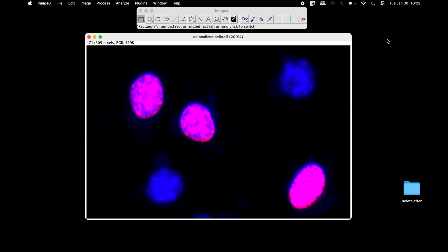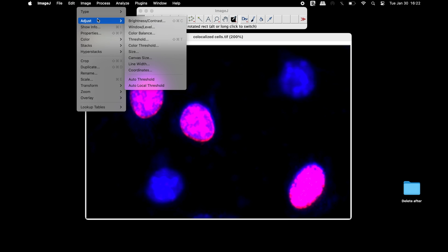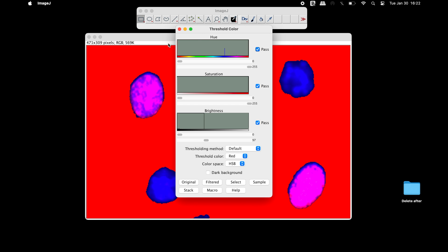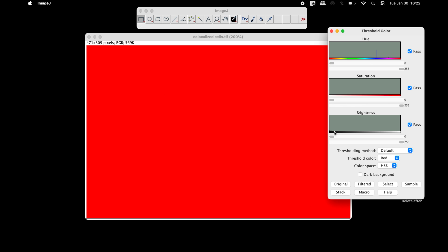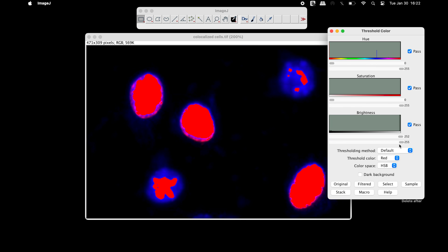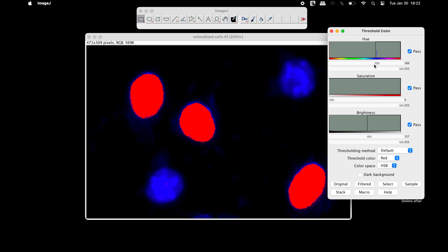The first step is to color threshold the image. In the threshold color window, adjust the brightness, saturation, and hue sliders such that only the double staining cells are thresholded. Users can also choose to use different thresholding methods, and the threshold color can also be changed if needed.